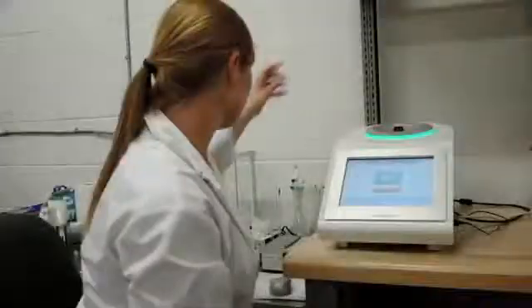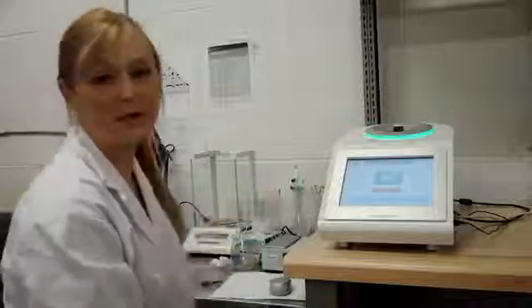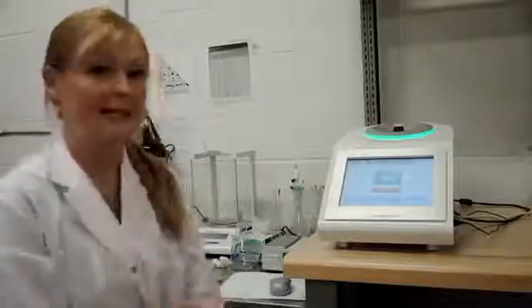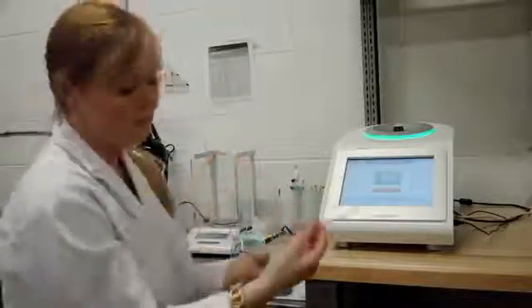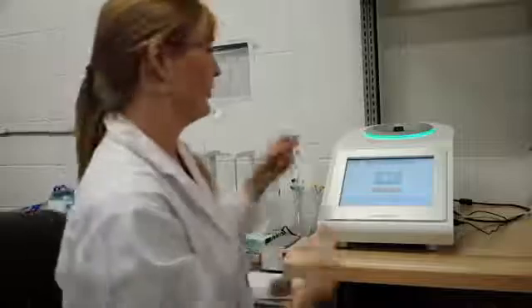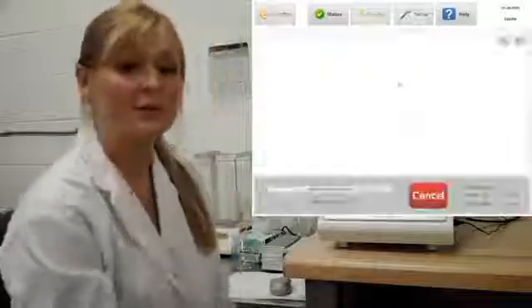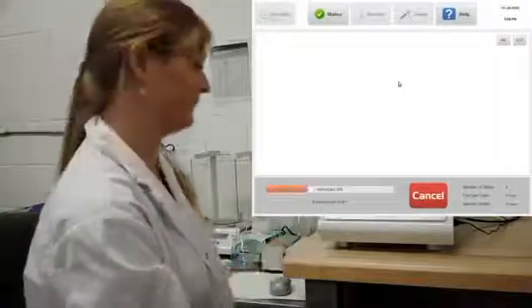And then before I finish, I just want to show one thing. So you may have noticed that I'm using this sample warmer as my tube holder. We do that because it extends the life of the optimal shims of the spectrometer, but you can easily run things that are at room temperature with no problem. So this is again the same ibuprofen solution, just at room temperature. And I'll just run a quick spectrum so you can see that there's no effect on the line shape when not using the sample warmer directly.